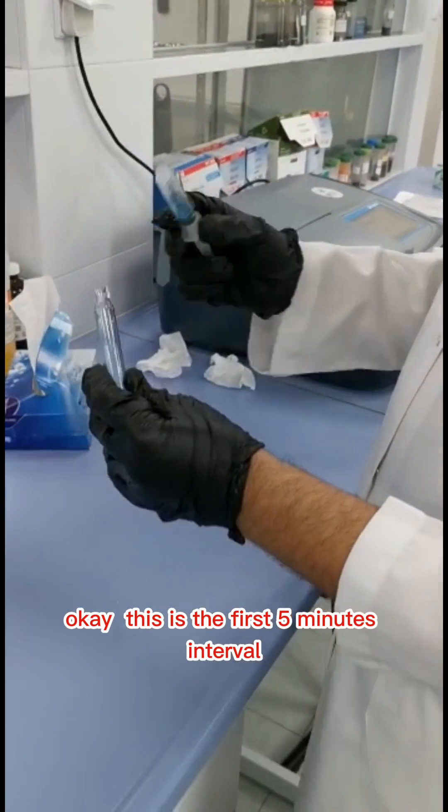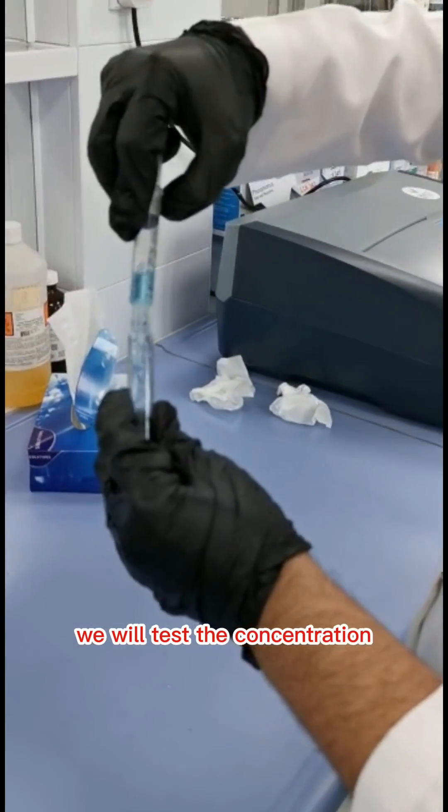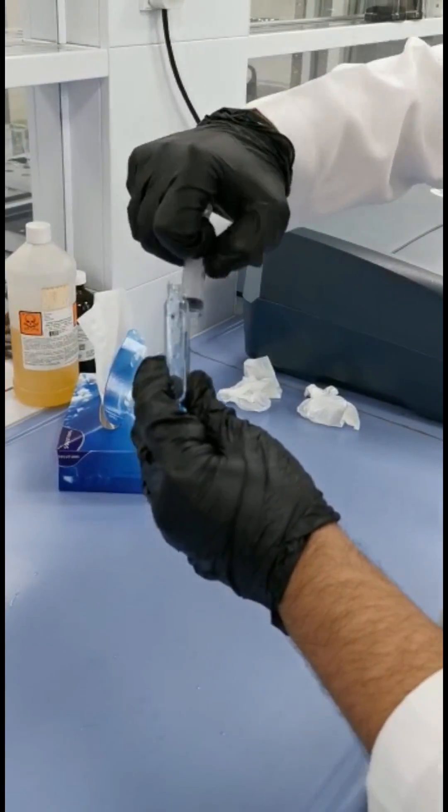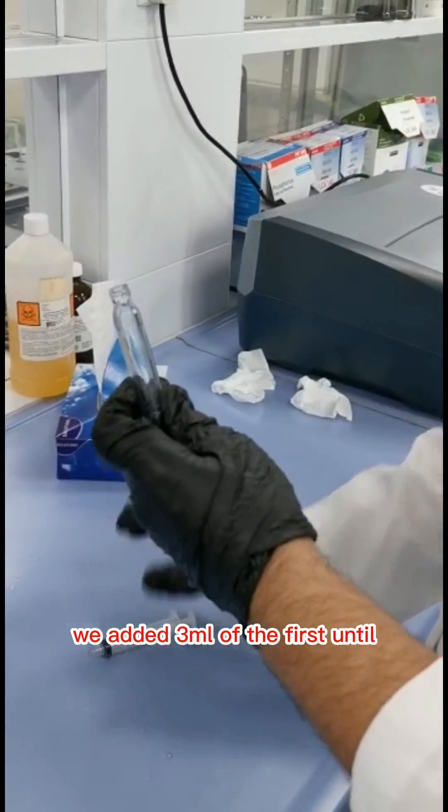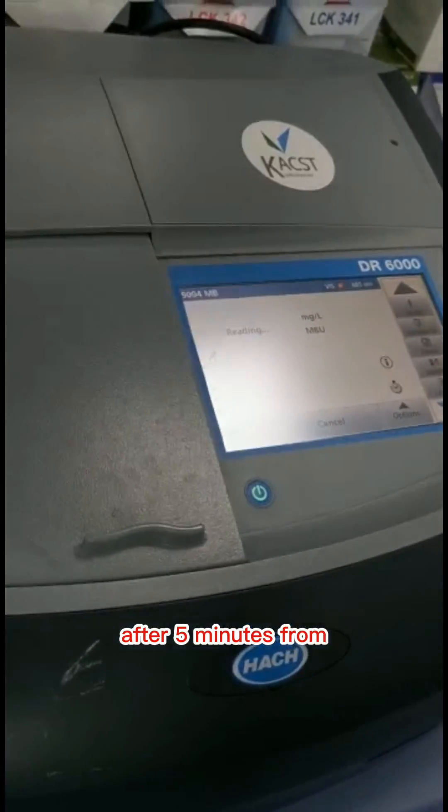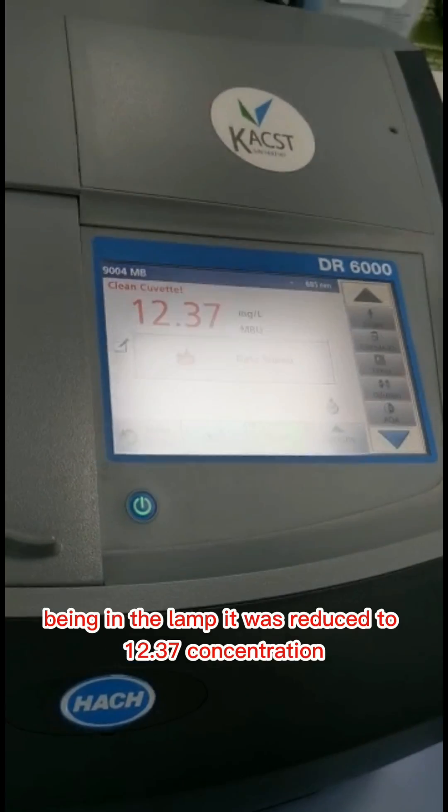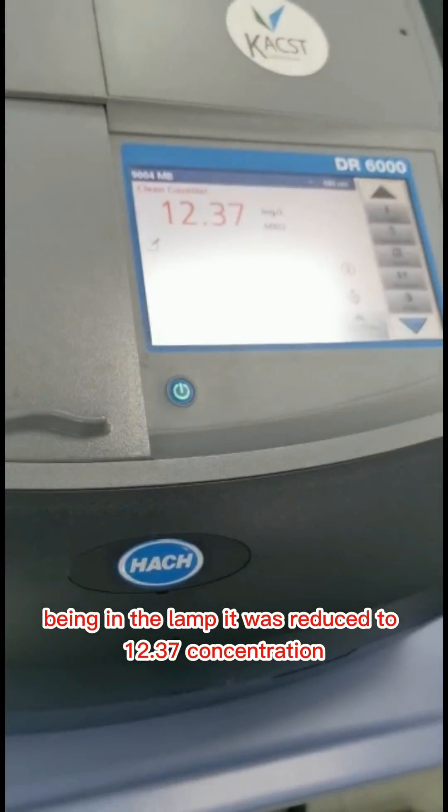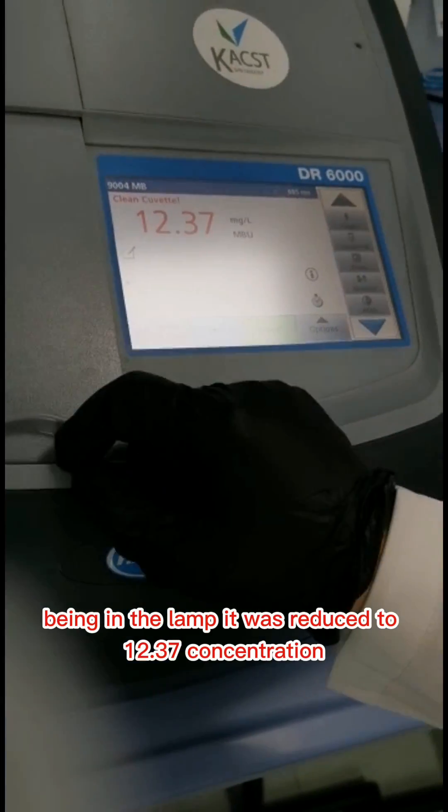This is the first 5 minute interval. We will test the concentration. We added 3 ml of the first interval after 5 minutes of being under the lamp. It was reduced to 12.37 ppm concentration.